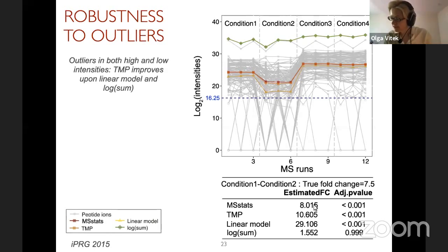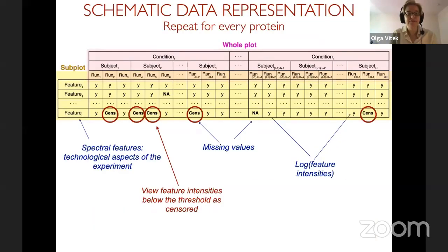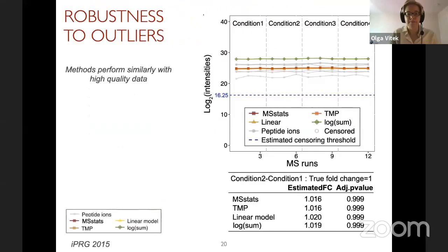A question I can maybe answer quickly: how does the protein inference, the peptide to protein step, change your summarization? We take as input the data as reported by the data processing tool. So whatever the data processing tool, including the identification steps and so on, maps features to the protein, we just take it at face value. So the only thing that we do in the converters, we may have some values missing based on the Q value threshold, and Meena will talk about this in more detail.